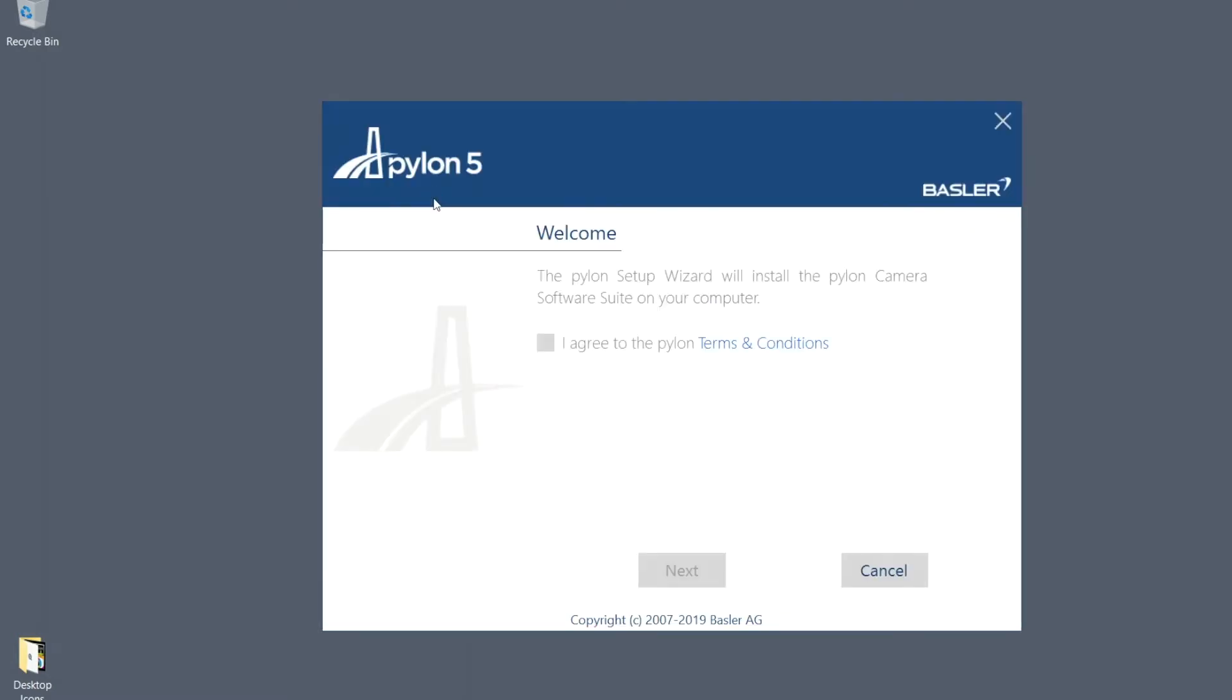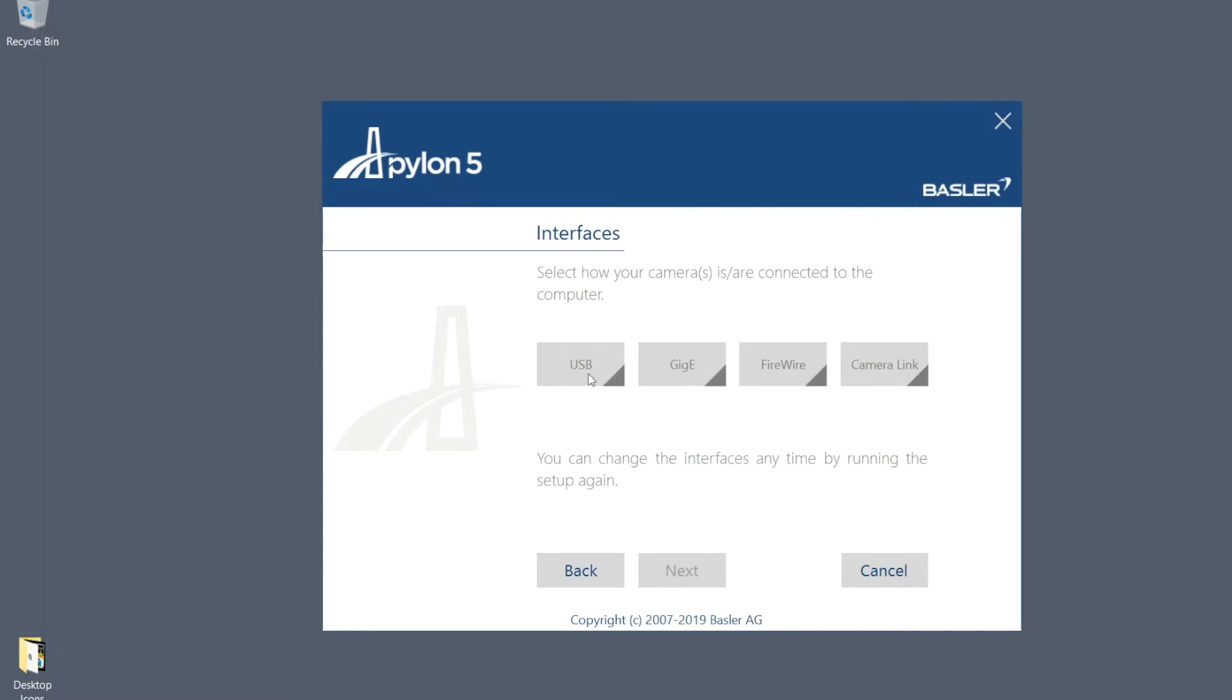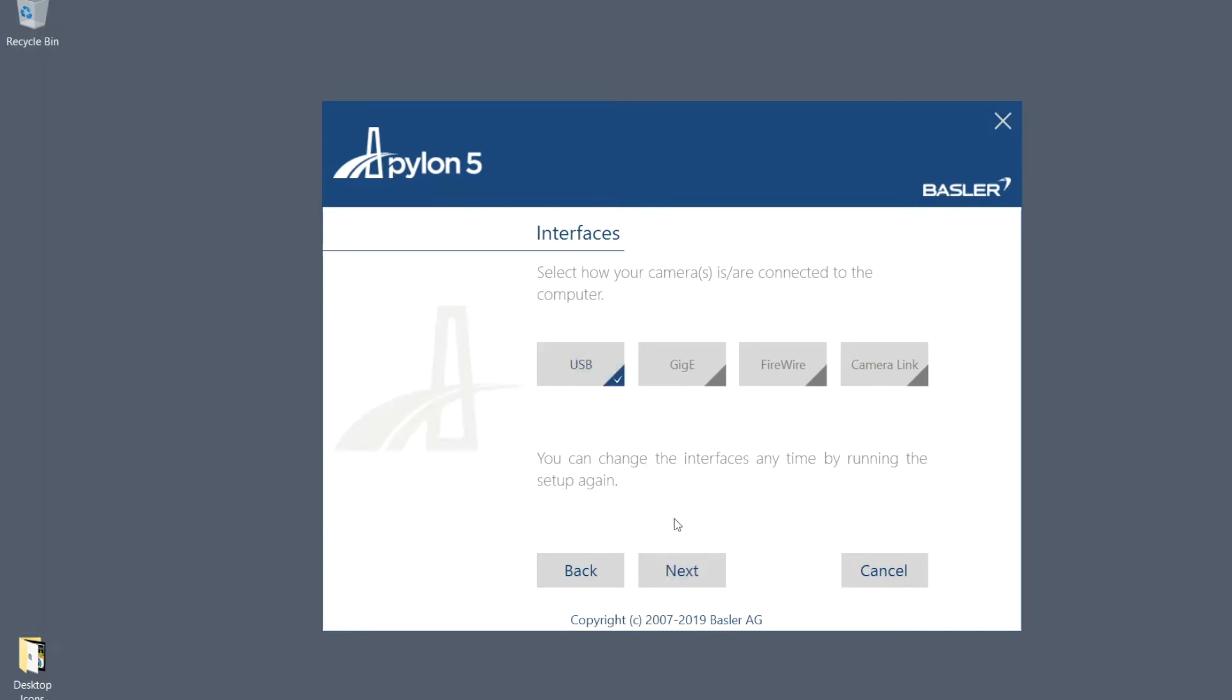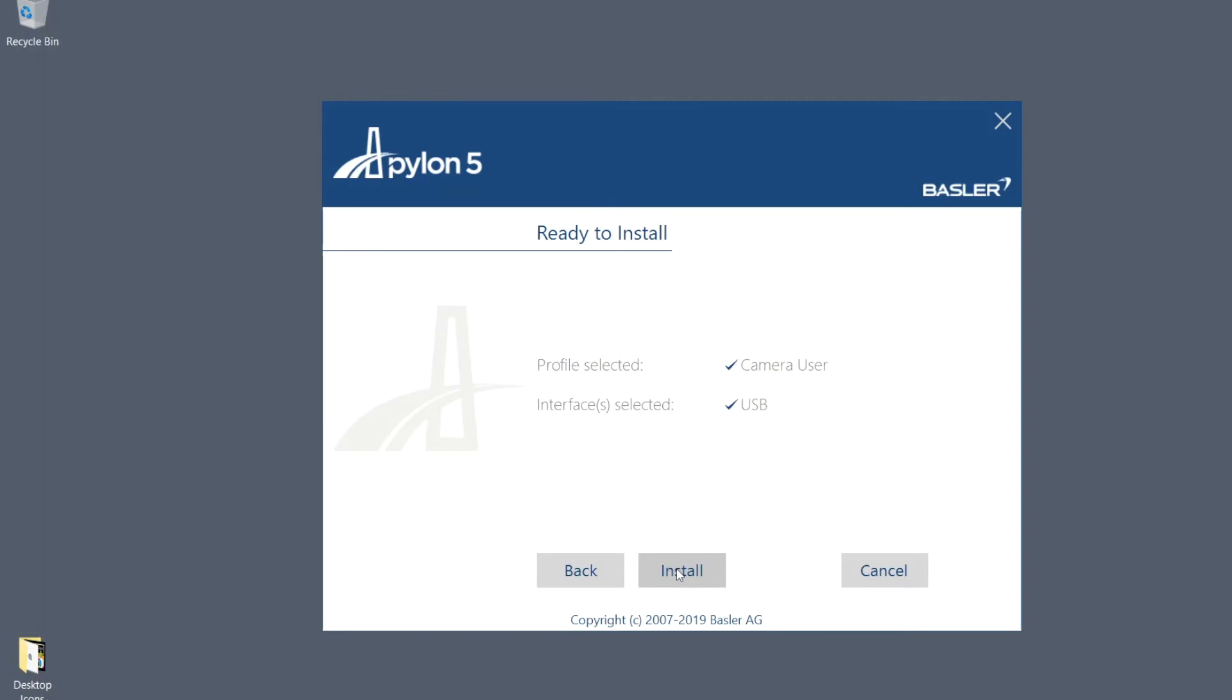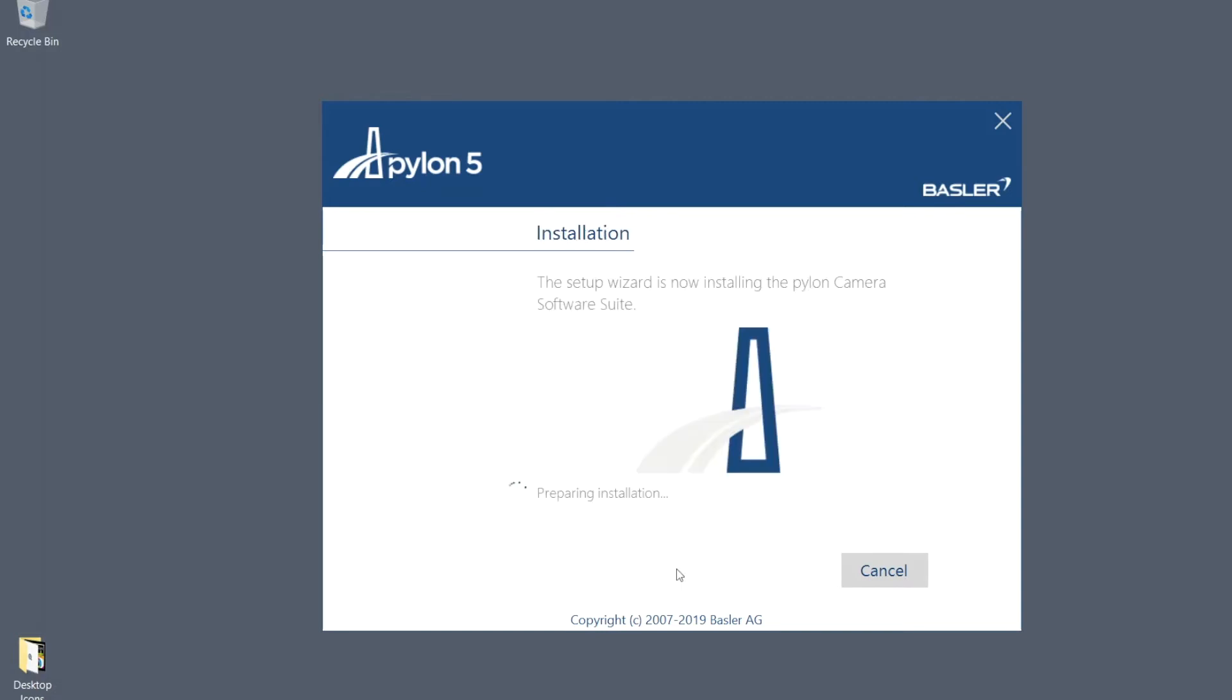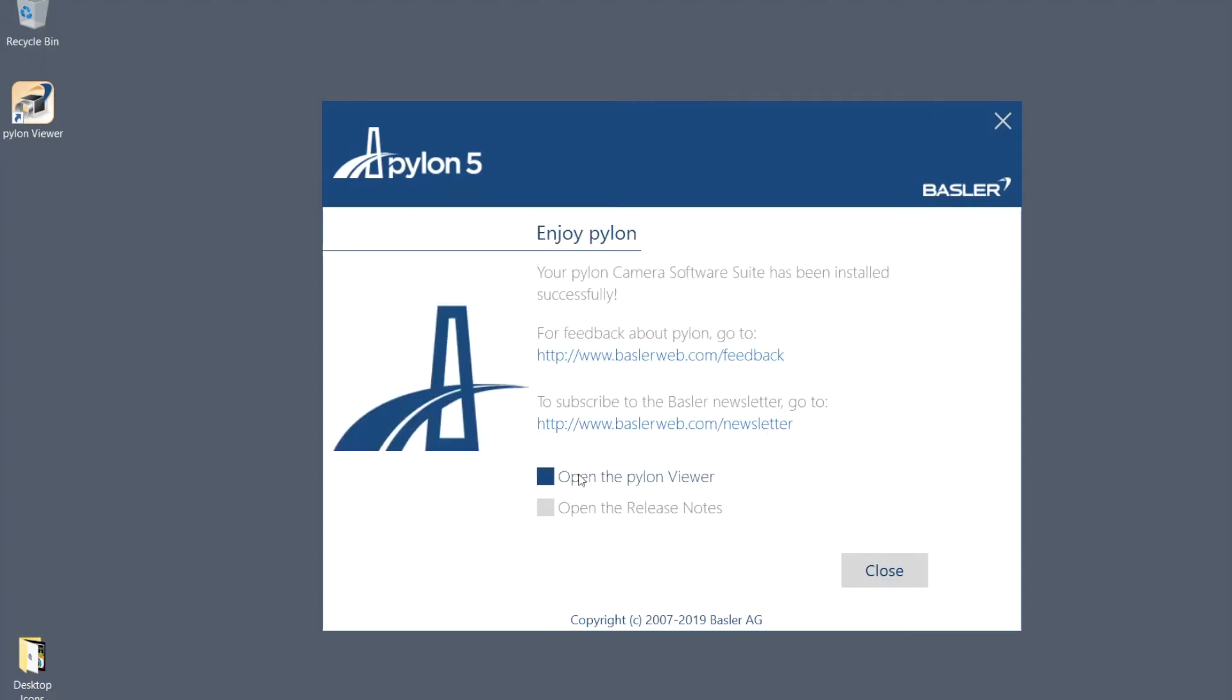Simply follow the steps of the installation wizard. The entire process may take several minutes to complete.